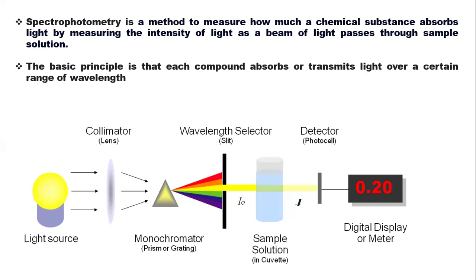If you look at protein also, they can absorb due to the presence of aromatic amino acids, tyrosine, phenylalanine, and tryptophan, and so on. Due to the presence of such aromatic rings in the aromatic amino acids, proteins can absorb light also. They can absorb light at a region of 280 nanometer. Some solutions cannot absorb light, for example, a sugar solution, a solution of glucose.